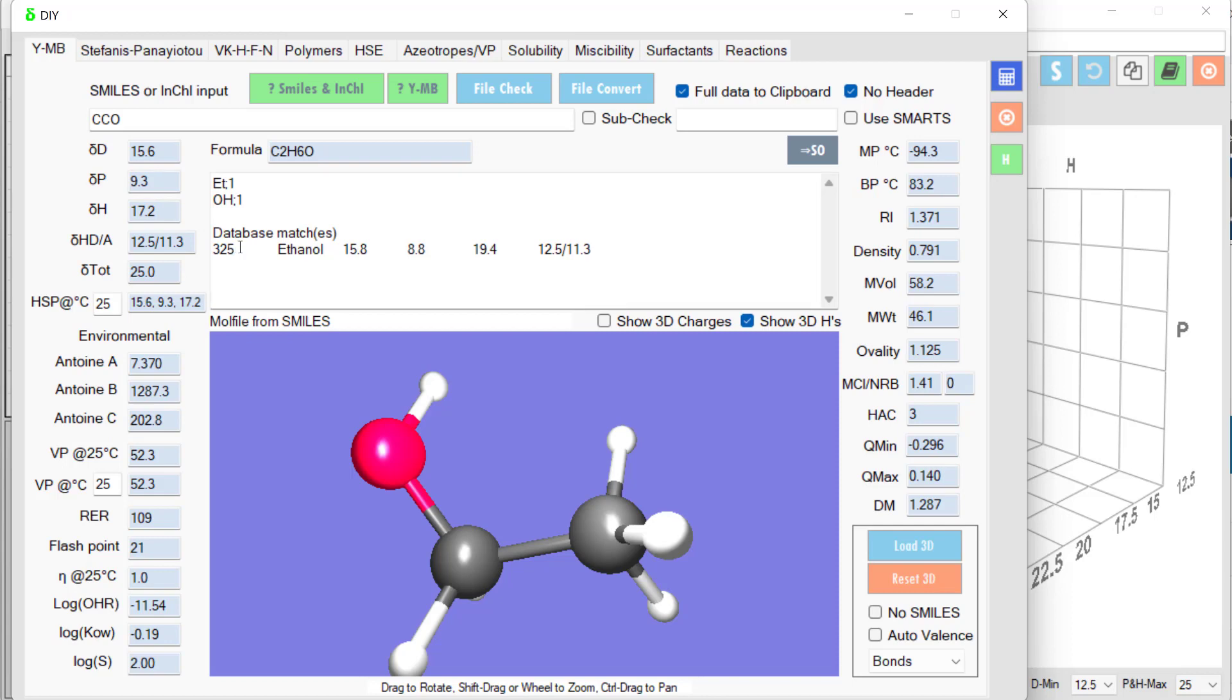It checks the database for this ethyl and OH group and finds that the real values of 15.8, not so bad, 8.8, not so bad, 19.4 may be a bit low. But that's how you can get an instant estimate.